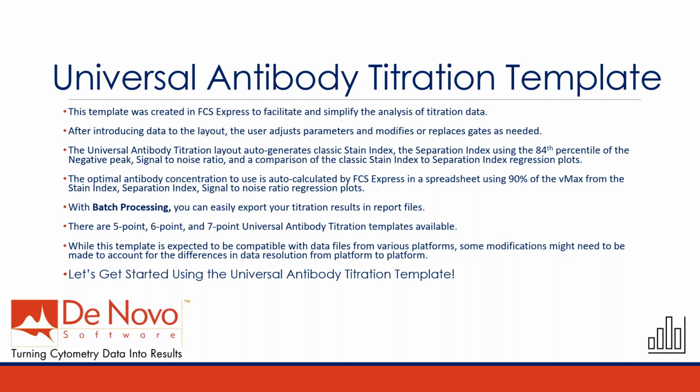And I should note, while we expect this template to work with any of the data sets that you're going to bring in, there may be some instances when you have to make some modifications. If you're not sure how to make that modification, or how to adjust for the platform that you collected your data on, just reach out to us and we'll make sure that we resolve that for you.